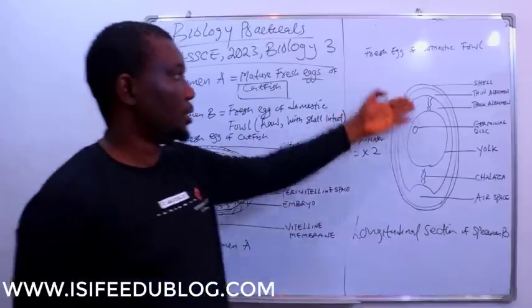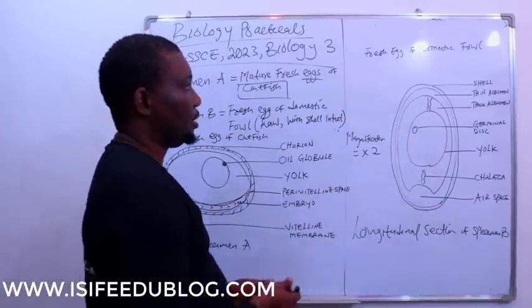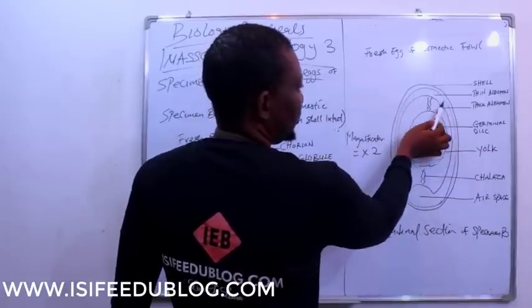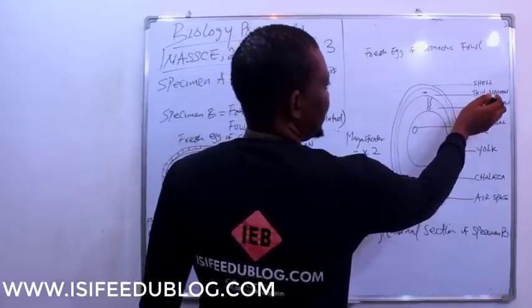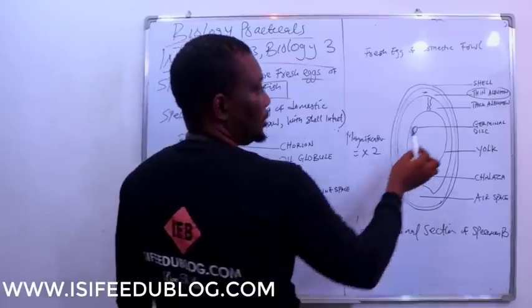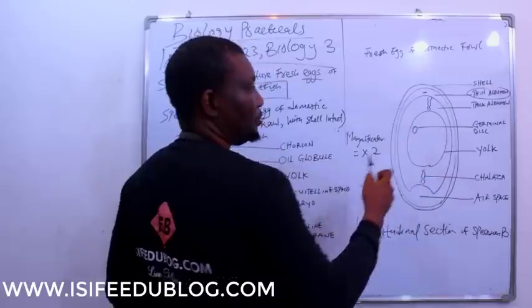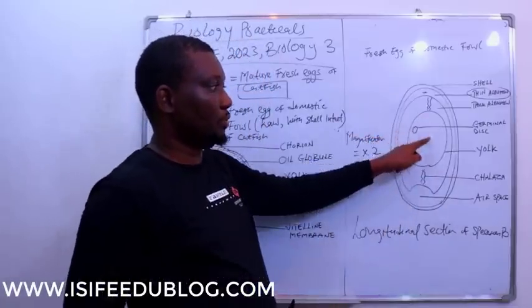color, the color partitions in specimen B here have the parts of the egg white. This particular surface after the shell is thin egg albumin. This region where you have the colors here is also white, but the white keeps fading to assume the color of the yolk.